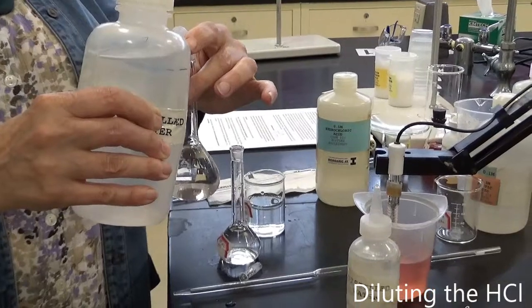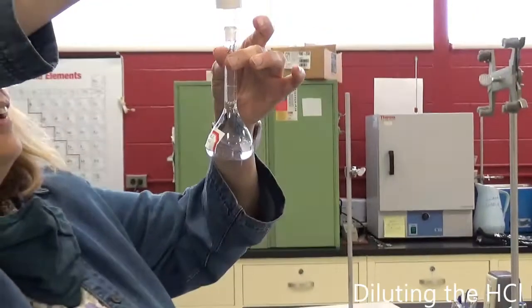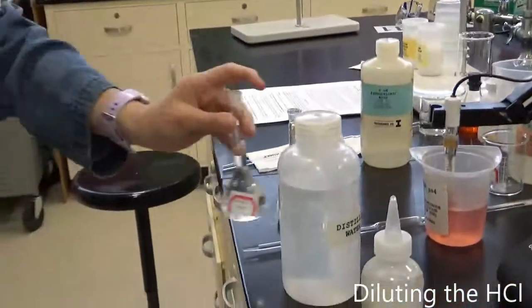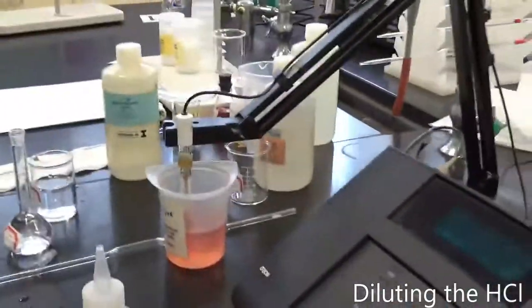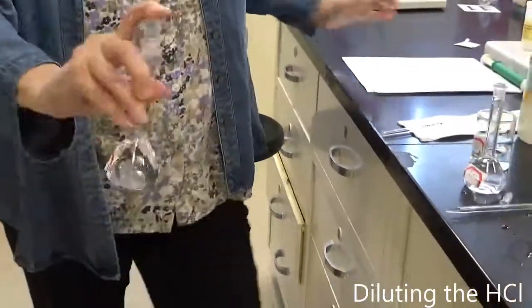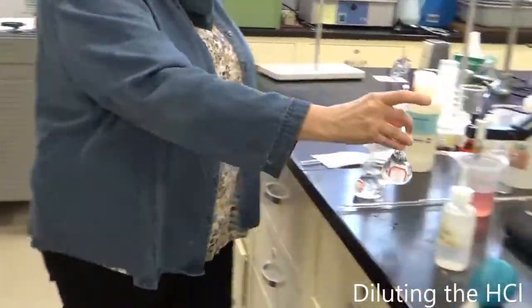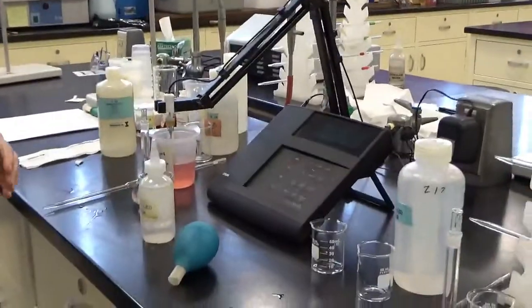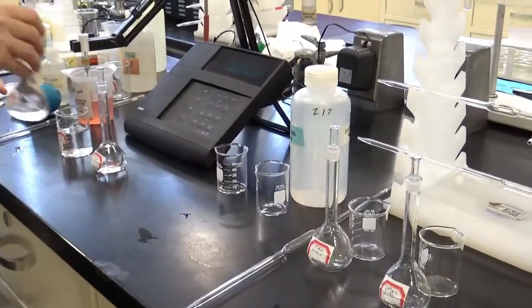And I want to get it right to the mark. So I'm going to use this bottle. Okay, there I am at the mark, and do you see the cap? And I'm going to invert and mix it 10 times. 3, 4, 5, 6, 7, 8, 9, 10. Okay, so now I have 10th molar HCl, the first dilution, which you will have to calculate what the molarity is, and the second dilution.